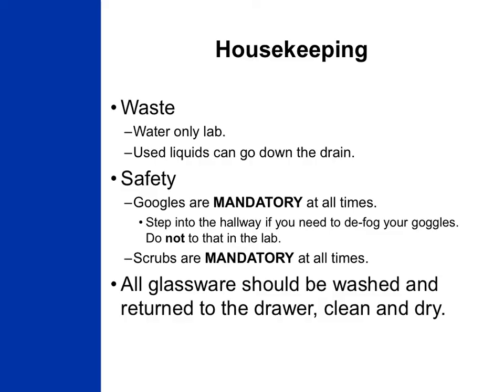Starting with clean glassware will reduce contamination in your work by ensuring you start off without any substances in your container. Never assume that glassware you see in the drawer, on a counter, or on a shelf was put there by someone else clean. When you finish, please make sure to return all of your glassware to the appropriate drawer, clean and dry.